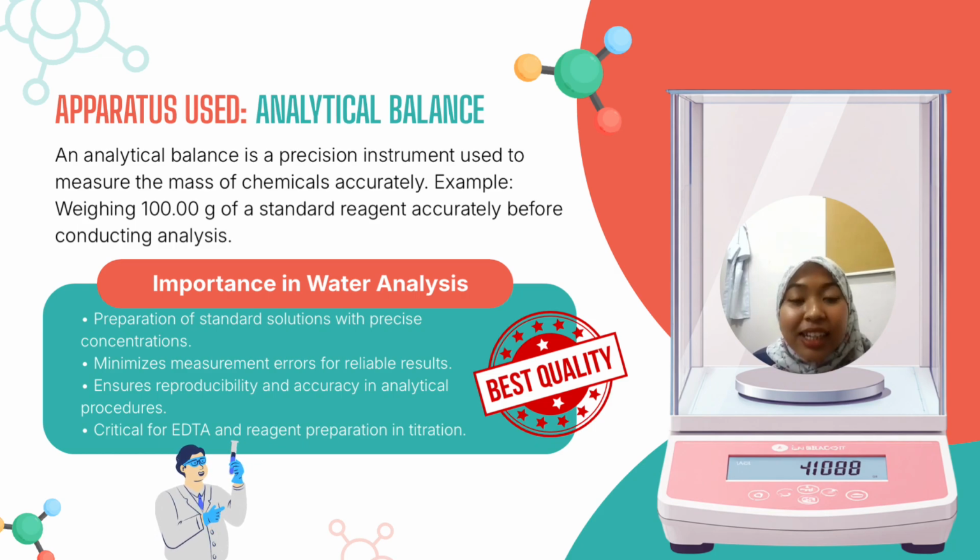Well, the analytical balance helps us prepare a standard solution with precise concentration. Next, it also helps to reduce measurement errors for accurate results. The analytical balance is also a critical aspect of titration. Therefore, it is very important to have an analytical balance in water analysis.